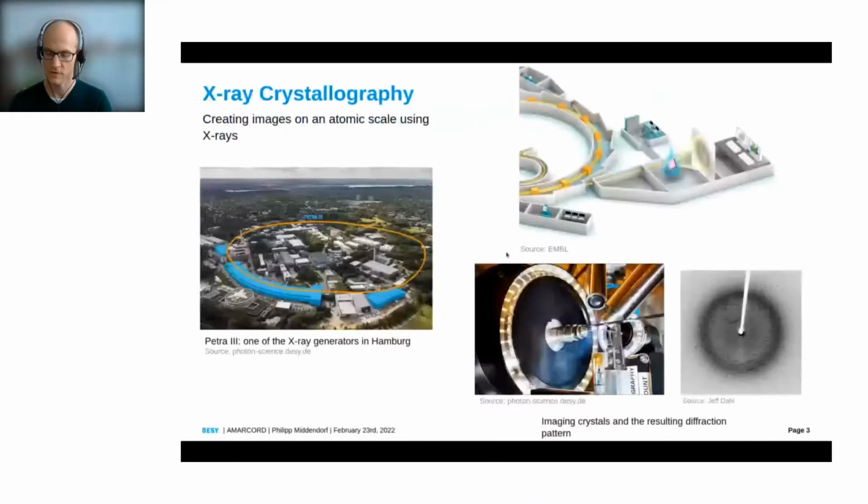So the idea of crystallography, or specifically X-ray crystallography, what we do here is to create images on an atomic scale using X-rays. Atomic scale meaning proteins, bacteria, molecules, that sort of stuff.